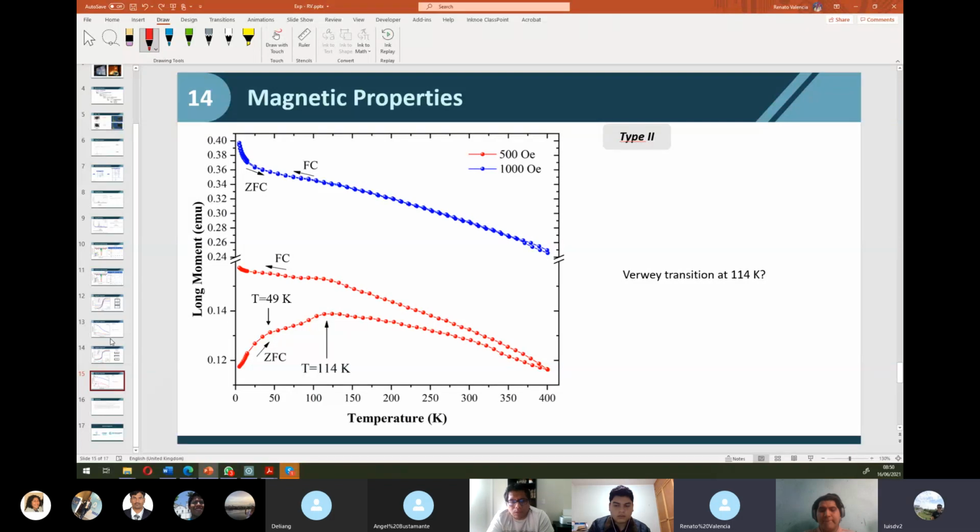Luis, I would like to say something. Go ahead. Well, actually, we have a technical problem with the Mössbauer measurement, but I think in the next week we could resolve this technical problem. But I think the Mössbauer measurement at low temperature is necessary, like Professor Bustamante told him. Well, I think that's all.